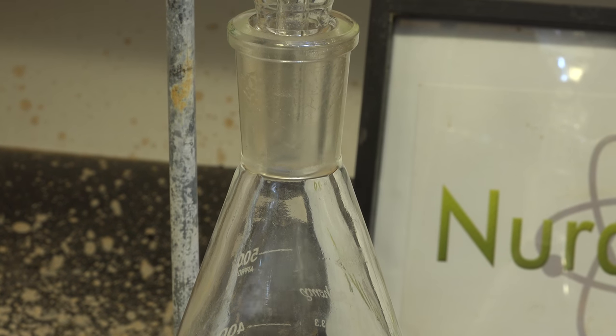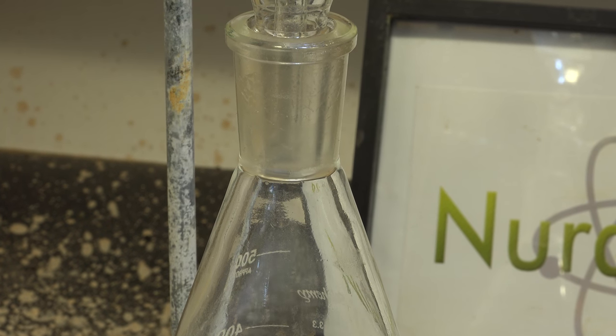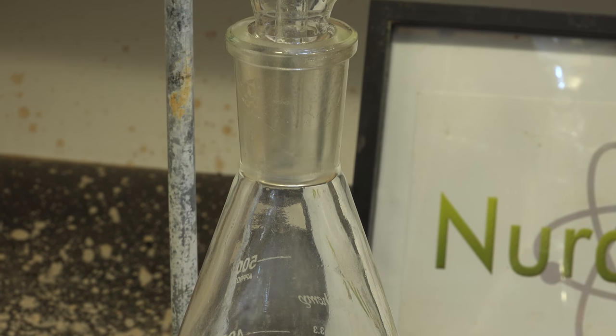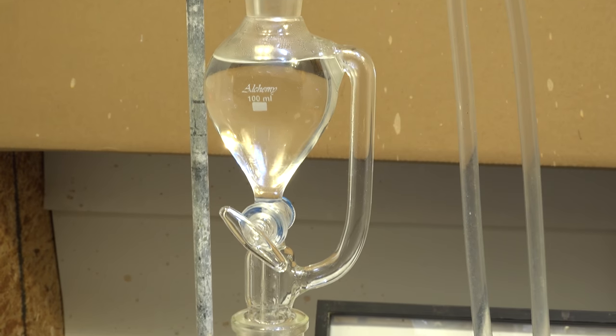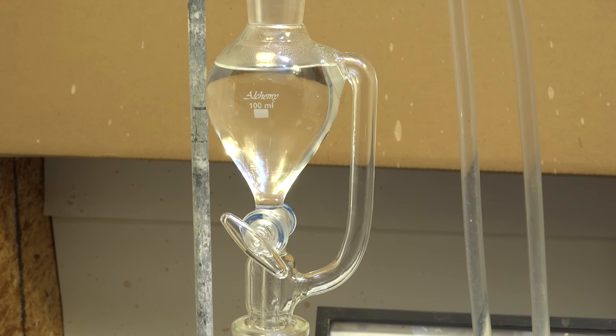Now it's hard to see through the ground glass joint, but it's dripping. What we want is for the rate of dripping to be just below the rate of condensation. So most of the solvent drips out and a small amount overflows out. This ensures the chemicals are always covered in solvent. At the same time, the constant dripping drains away whatever chemicals have dissolved and replaces the solvent with fresh solvent from the condenser. We can't open the valve all the way because the solvent will drain out, leaving some of the chemicals uncovered and thus undissolved.